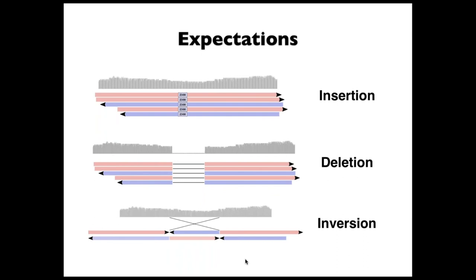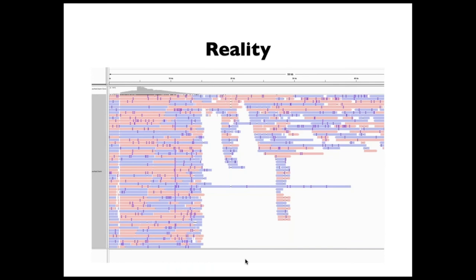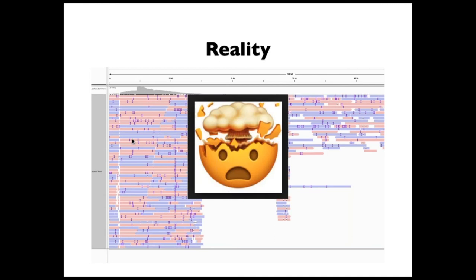That's basically the framework for detecting structural variation — so much for expectations. Reality often looks very different. This is an example from the wild: here on the left is part of a tandemly inverted repeat, and it's just a huge mess that leads to really crazy output in your genotypes and structural variant calls. To summarize that slide: that's how I often felt when looking at these alignments.